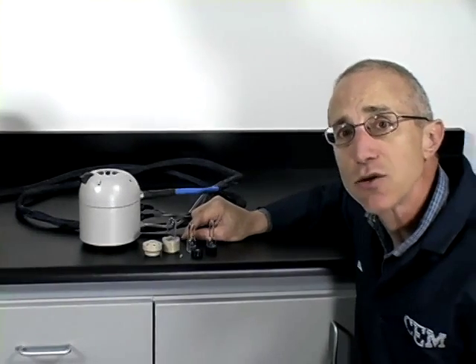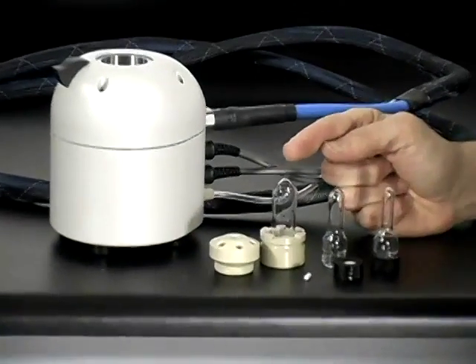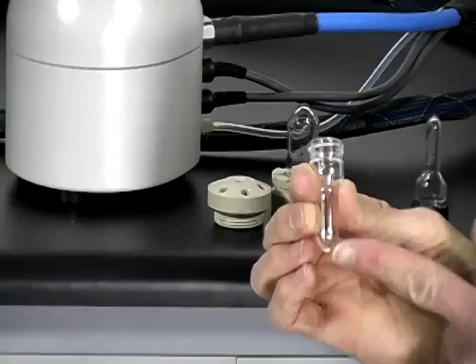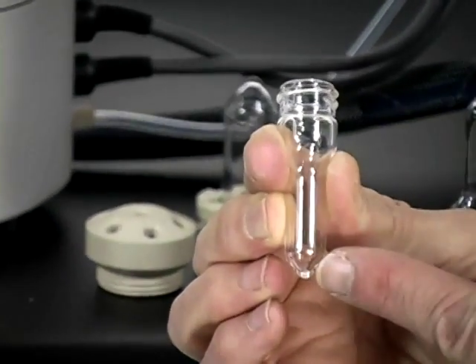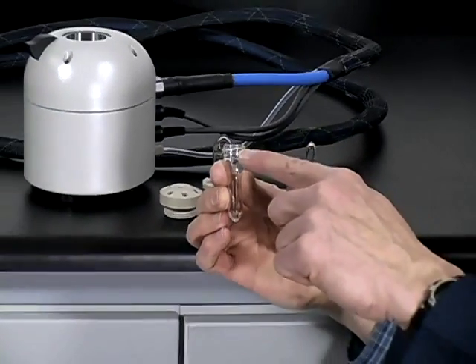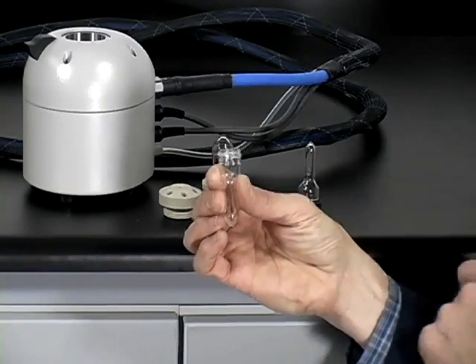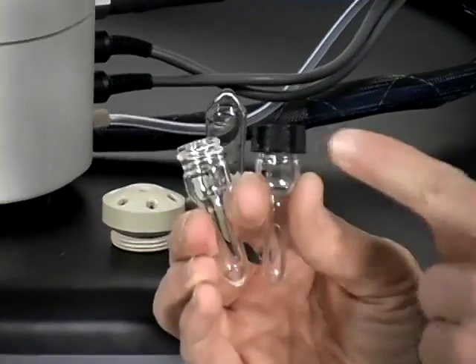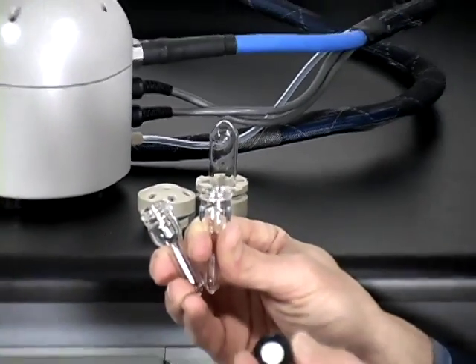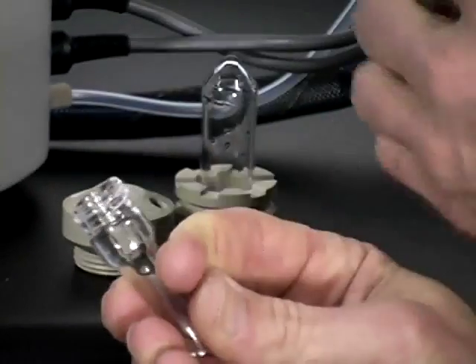Now we'll talk about the vessels that come with the CEM PetWave. The vessels come in three sizes: 1 mL, 2 mL, and 4 mL. The vessels all have a thin-walled conical bottom — the thin wall is needed so the infrared sensor in the remote cavity can read the temperature. The tops of all three vessels are the same: the opening and thread design are identical, so one cap fits all three vessels. The caps used are either a screw cap with a septa and a hole, which is used for syringe filling and removal, or a multi-port head.